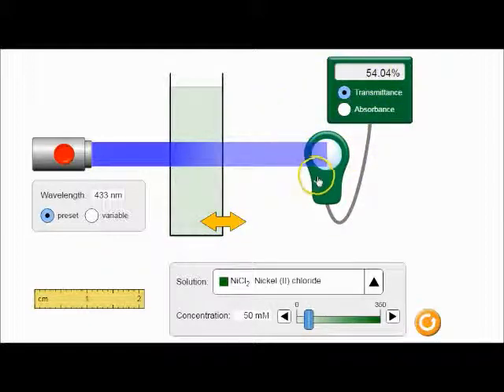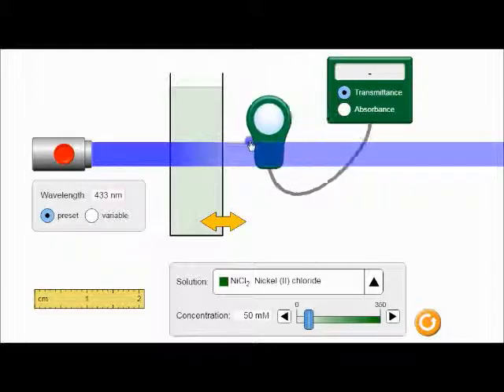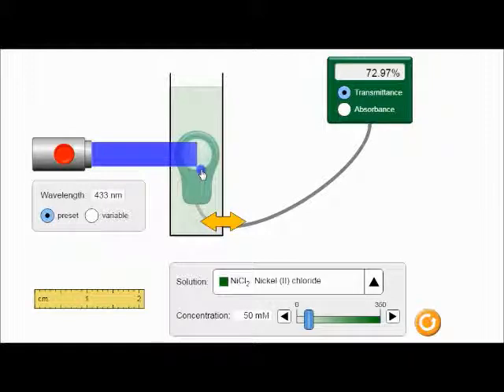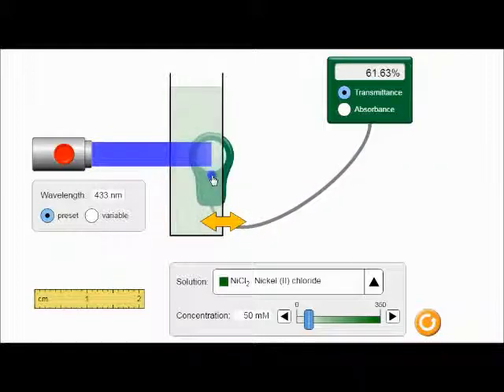So that's cool, right? This tool, although it looks like the same tool that we used in the concentration virtual lab, it's not, because look, it doesn't say anything if you are putting the sensor inside the tube, the cuvette, I mean. Oh, but look, it can measure the intensity of the light that is inside the cuvette, and in fact, that changes as I go forwards and backwards towards the light and away from the light. So what's that all about?